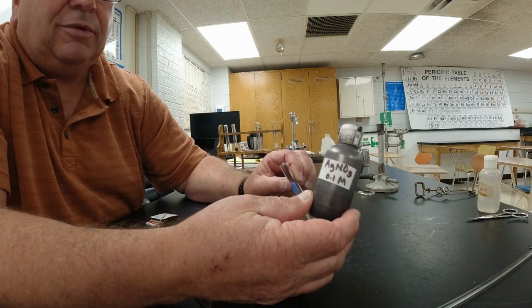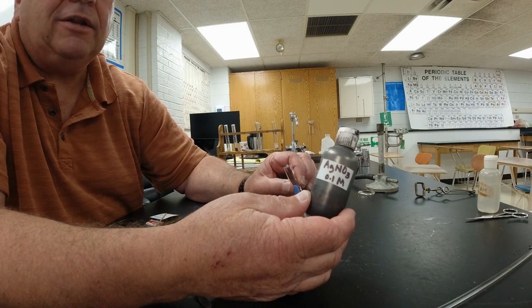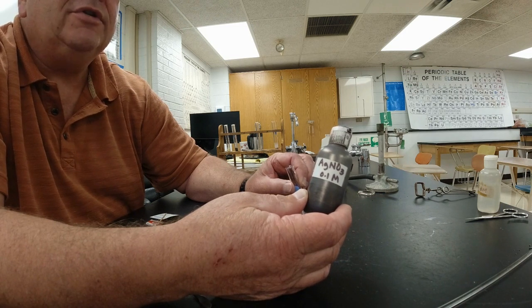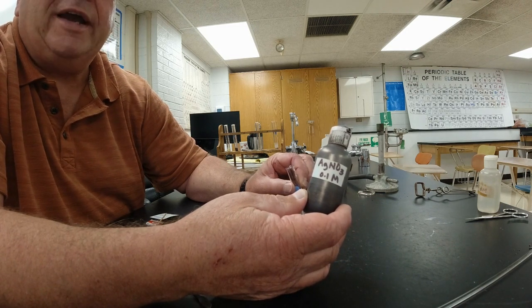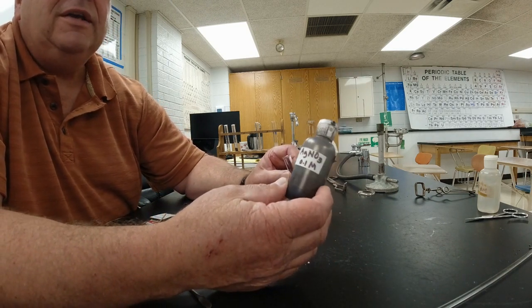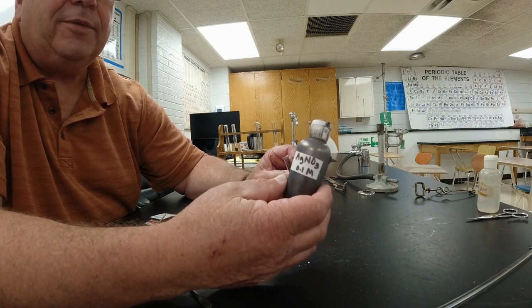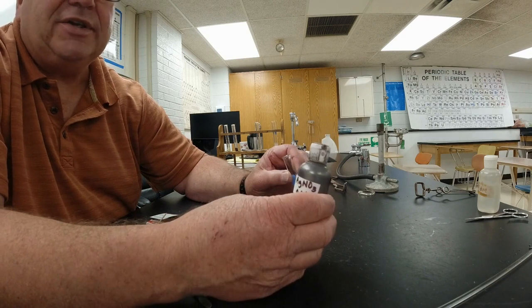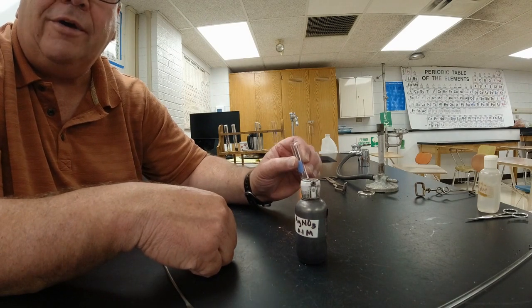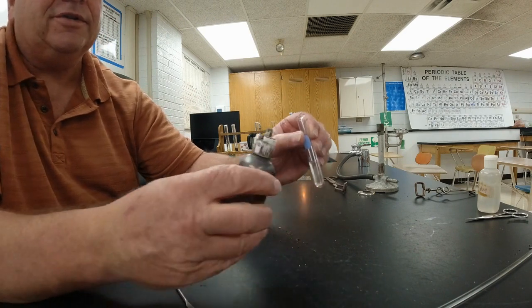Now, this bottle normally would be clear, but silver nitrate turns black when it's exposed to light for very long. And this is a really expensive reagent. A reagent is a chemical that we use to do chemical reactions with to tell something is there. So I'm going to be really careful with this. First of all, silver nitrate is toxic, and you need to try to keep as much of this away from your skin as possible. I've had lots of silver nitrate on my fingers, but if you get it on your finger, within an hour the spot where the liquid was is going to turn black. You're going to have a black spot, and it's there until the skin wears off.